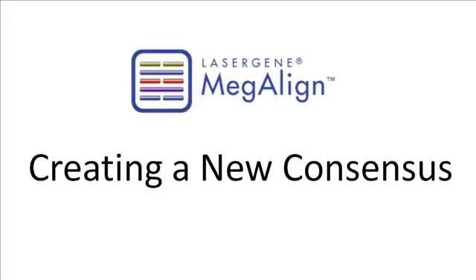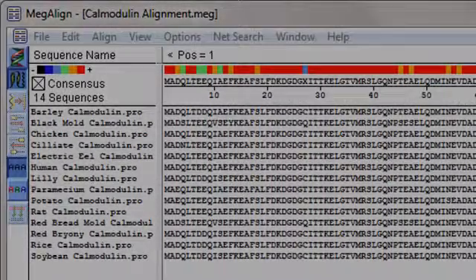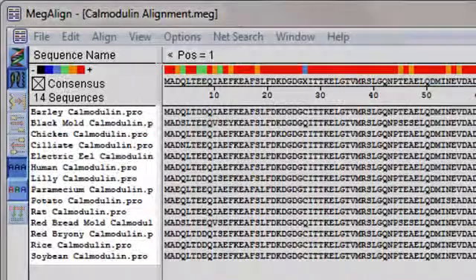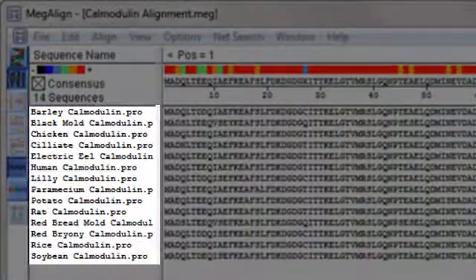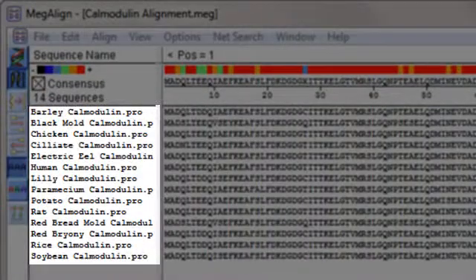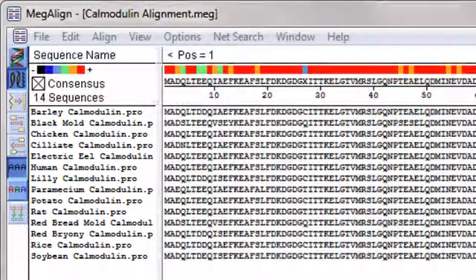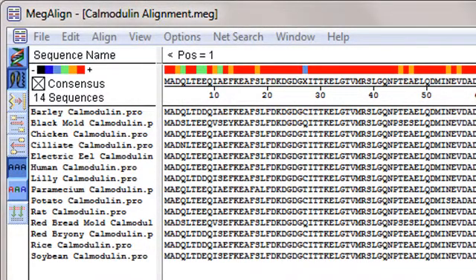Megalign's new consensus command lets you define a new consensus sequence for the alignment report. My project is composed of calmodulin sequences from different species. I'll start by viewing the alignment report for my project.